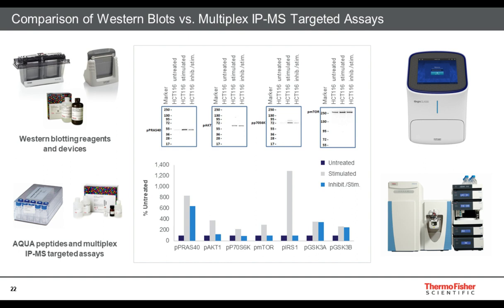There is variability between these 2 techniques for some targets, specifically phospho-AKT and phospho-mTOR, and that could be due to the antibody specificity because you are using different antibodies for different methods.